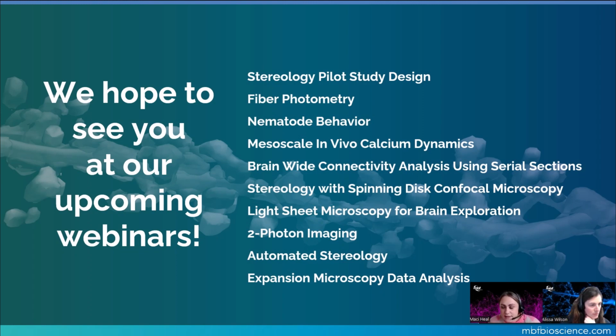Like we said in the webinar, we just put the vessel analysis together in with the neuron analysis in Neurolucida Explorer, and we're really hoping to expand that tool set so you can do the specific investigation you need to do. So I would love to follow up with you about those specific needs and what kind of data you'd like reported there. But we can calculate the distances between those objects.